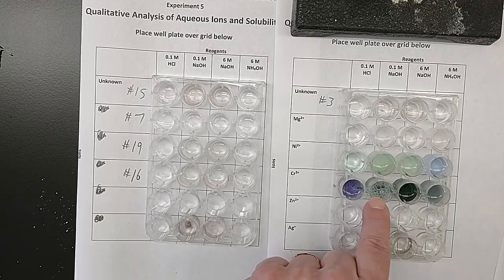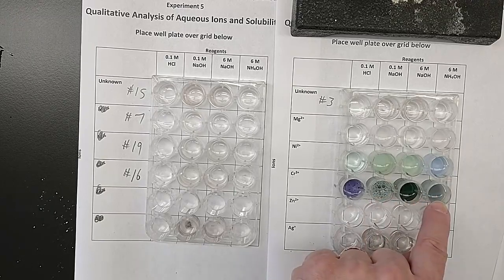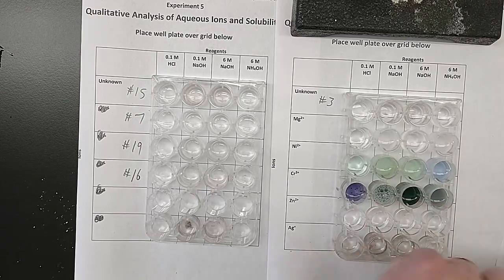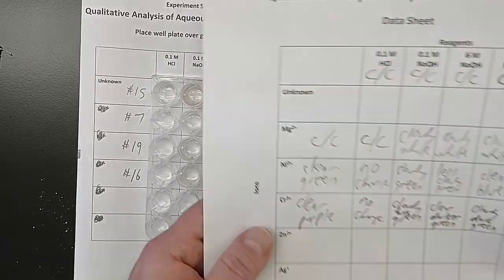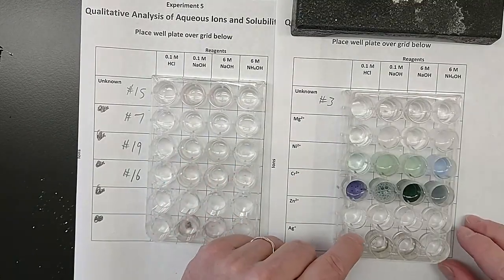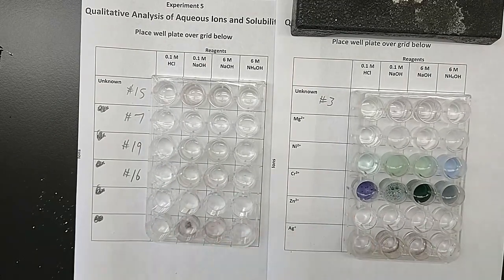So this sodium hydroxide and this ammonium hydroxide that's more concentrated look very similar, ignoring the foam. So I'm going to just call that a cloudy dark green, not cloudy darker green. Okay, so on my data sheet, I've recorded what I think each of these look like. You can certainly record what you think they look like. On to the zinc.